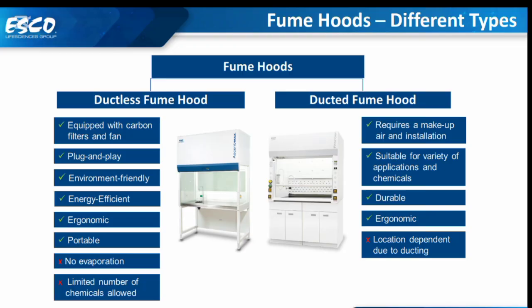Yet the ducted fume hood requires makeup air and installation, suitable for a variety of applications and chemicals. So almost all the chemicals can be used in a ducted fume hood. Of course, we have some fume hoods that are specialized for certain chemicals, but yes, the ducted fume hood has always been seen as the better solution when it comes to fume hoods.